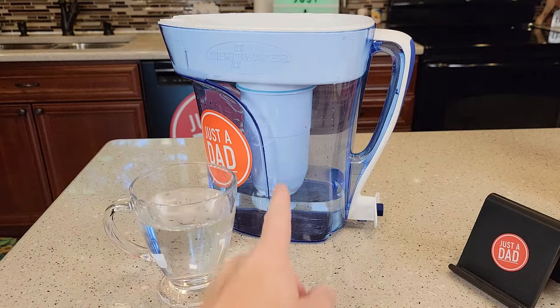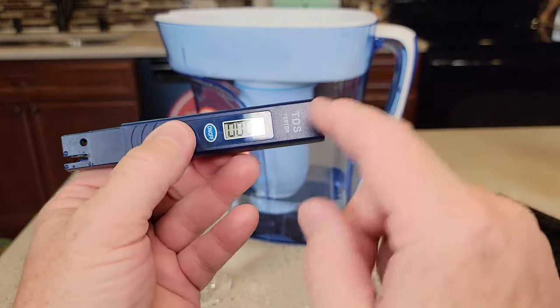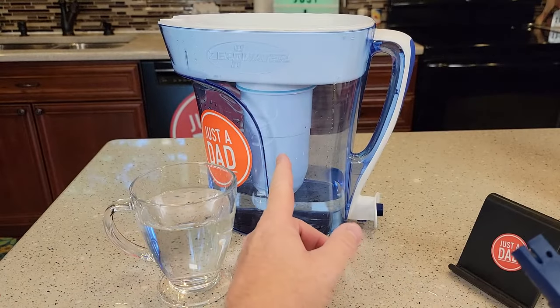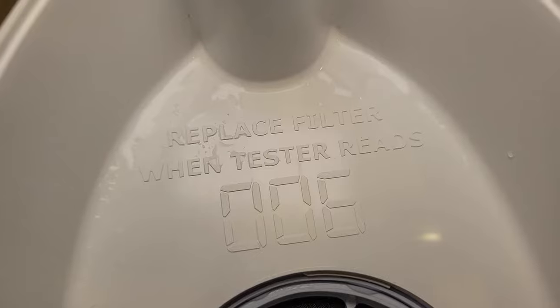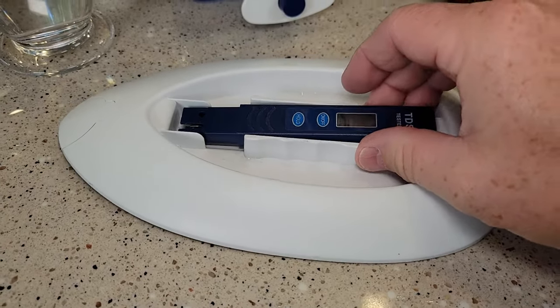When the water coming out of the filter is six or higher on this scale — 006 or higher — that means it's time to change that filter. Sometimes they have that stenciled in somewhere on the actual Zero Water filter. On this pitcher, there's even a nice feature where it holds the tester in the lid.